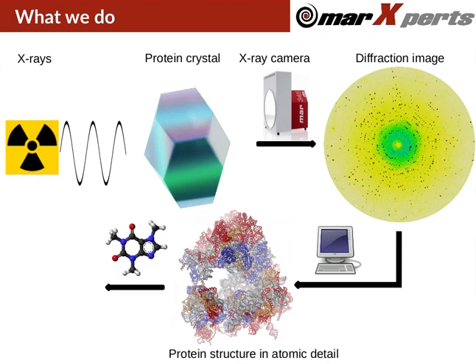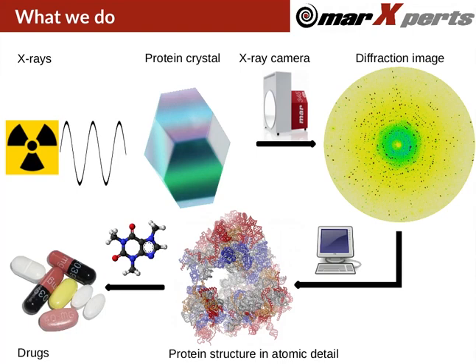Pharmaceutical companies systematically use the knowledge of the atomic protein structures to design new drugs. This process can yield highly specific drugs against a large variety of diseases. Therefore, these techniques today are really essential for drug companies.